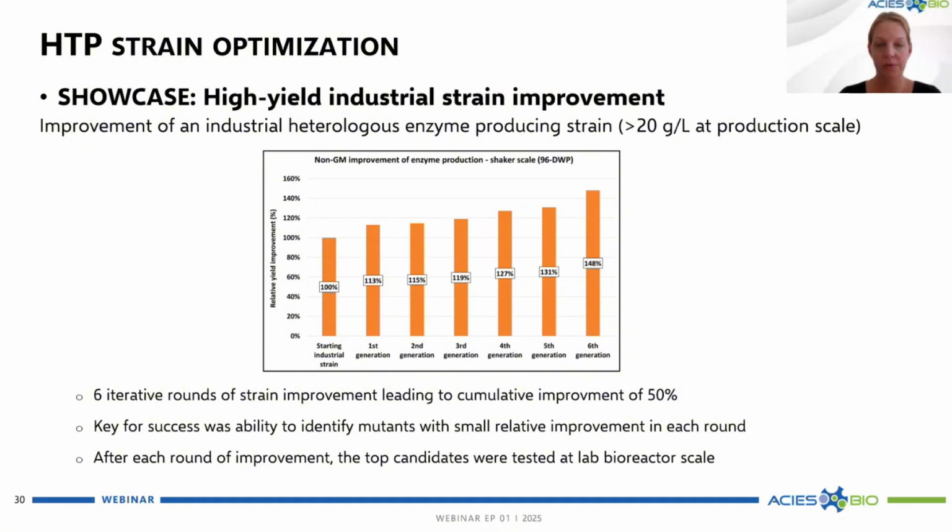Okay. So now maybe we go a little bit more in detail into adaptive laboratory evolution. Gregor already mentioned a few words about ALE, or adaptive laboratory evolution. This is actually a strategy that we are using often, where we rely on microbes' natural adaptability and natural selection. As cells grow and divide, spontaneous mutations occur, and those strains that have some kind of fitness advantage in these conditions then become dominant in the population.